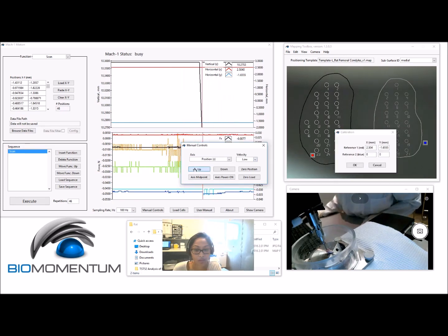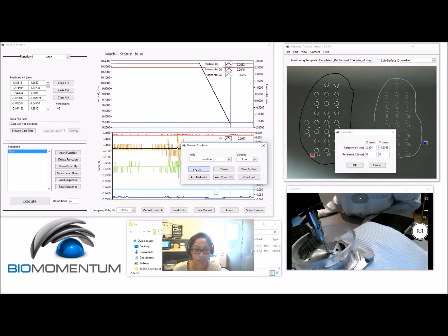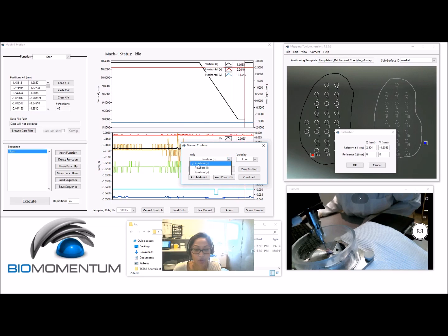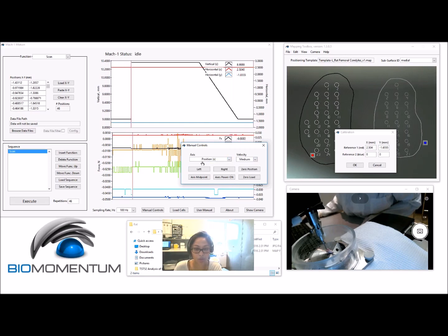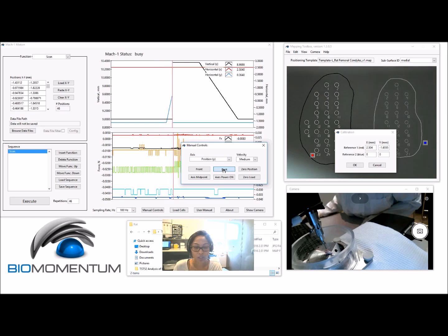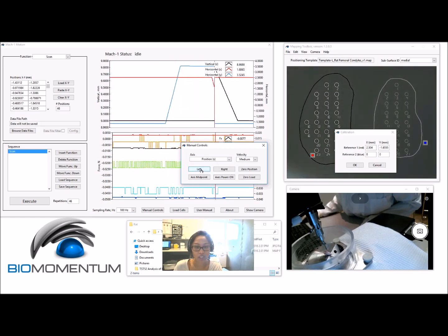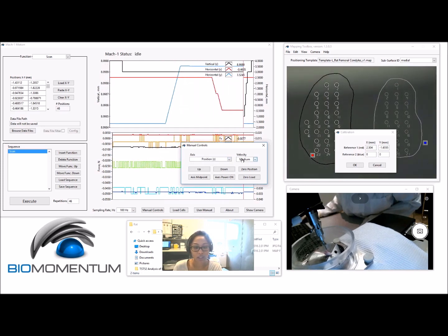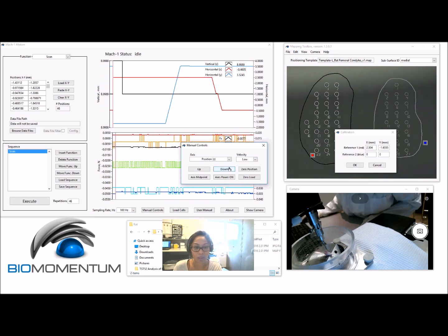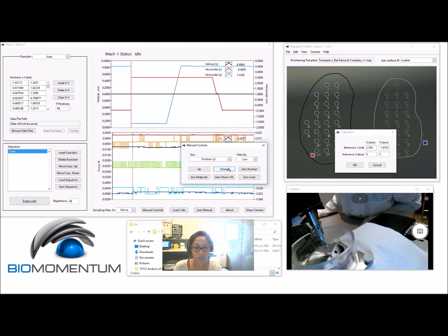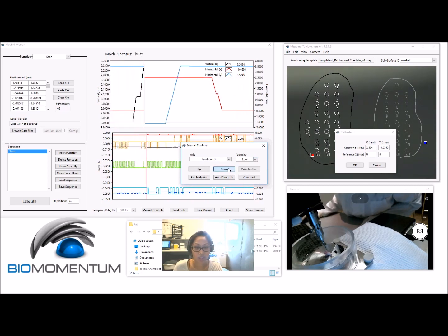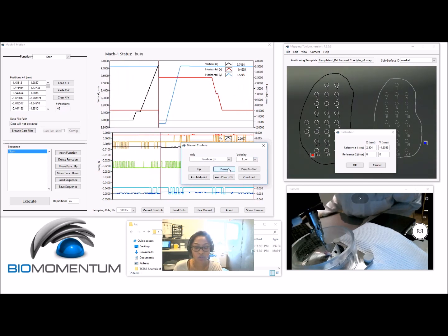Don't forget to raise the vertical stage before moving onto the second reference mark. Repeat the same procedure for the second reference mark by moving the stages so that the center of the MAC1's indenter is positioned just over the mark.